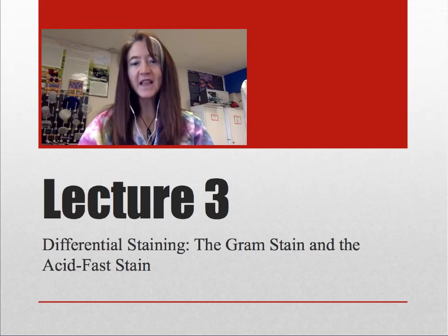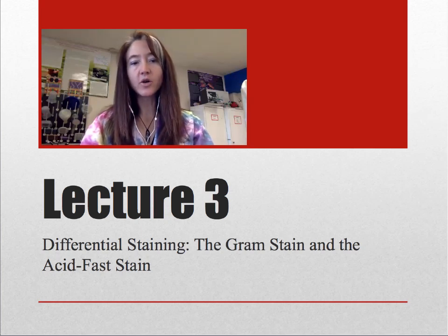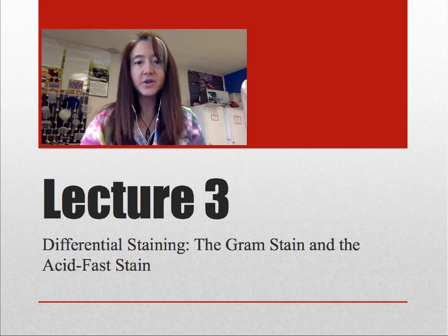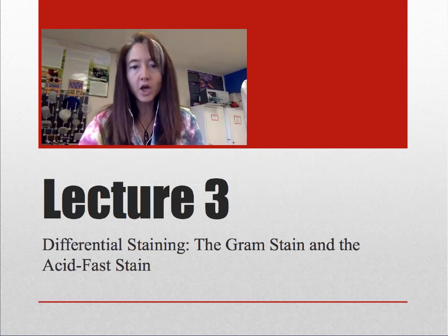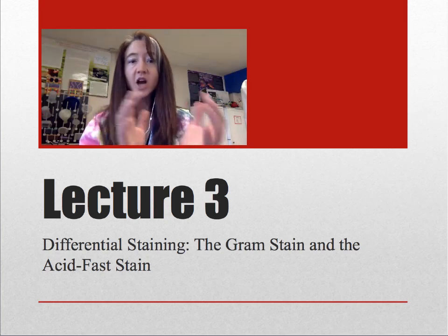Hello again. When we last met, we were talking about simple stains, and you'll recall that with our methylene blue dye and our Congo red stain, we were coloring everything the exact same color. So it didn't matter whether we were looking at yeast cells, that is Saccharomyces cerevisiae, or bacterial cells such as E. coli. No matter the cell structure, everything stained the same color. There was no differentiation between colors.